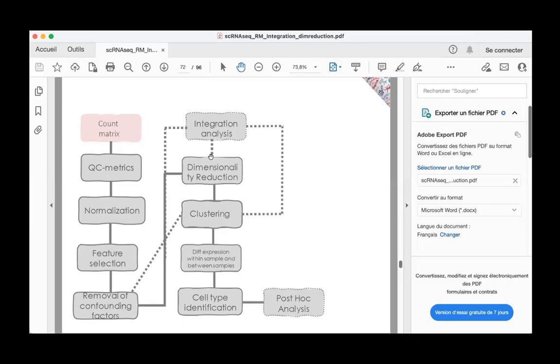Now we move on to dimensionality reduction. In the exercise you saw that there might be a batch correction that you want to do — some integration as it's called in Seurat — and then come back to dimensionality reduction to see if what you did has been correctly done, such that you now have a beautiful visual picture that is nice enough to make good conclusions about for your paper.